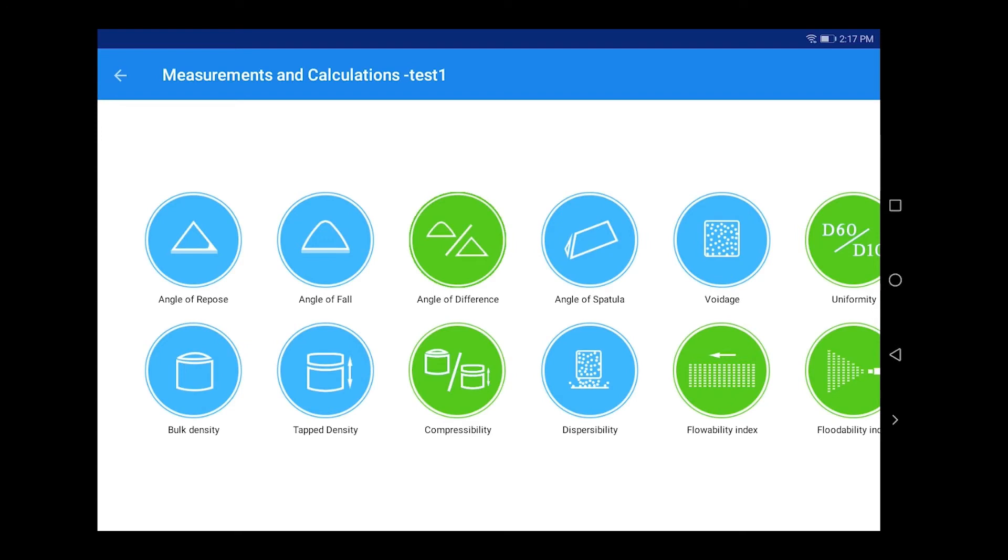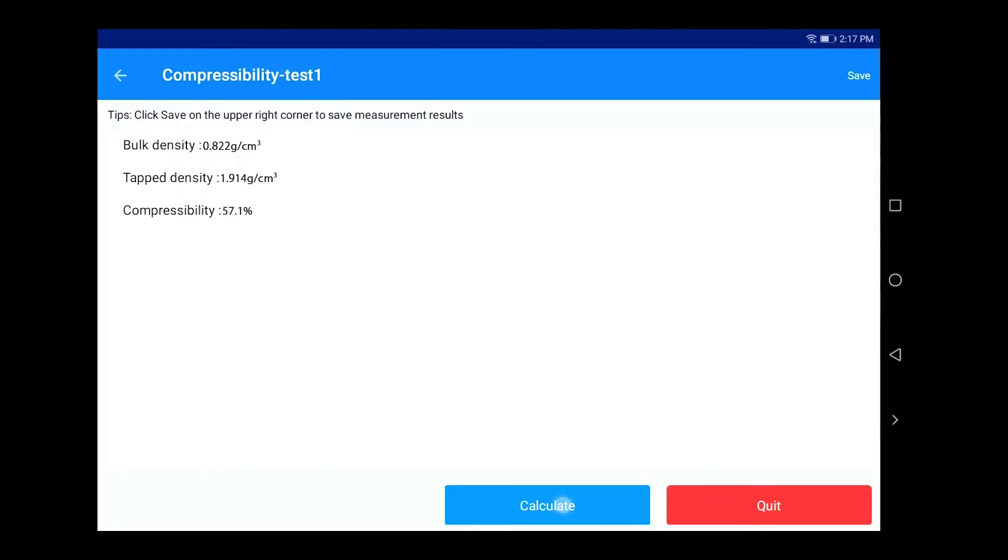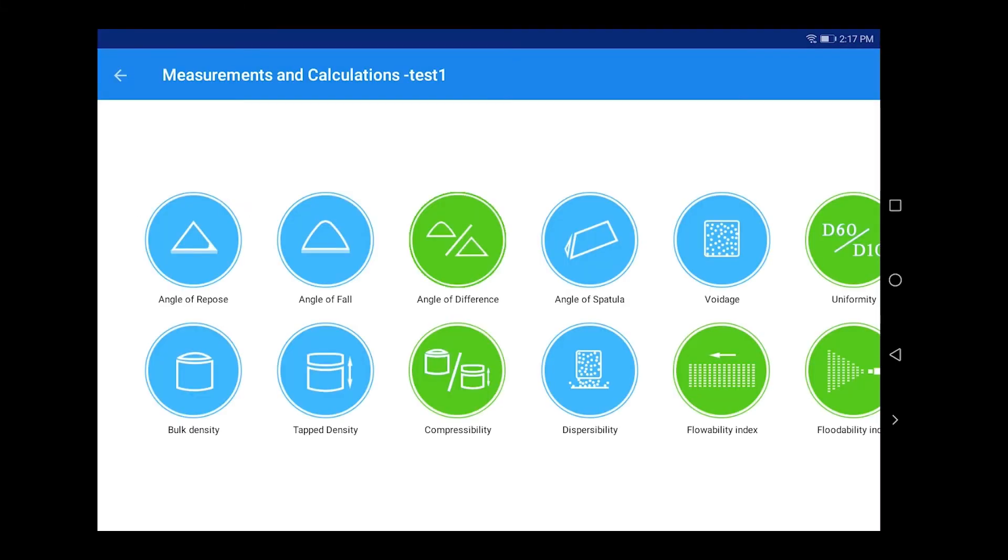After the bulk density and tap density are measured and saved, click Compressibility. Click Calculate to calculate compressibility. Click Save and quit to complete the calculation of compressibility.